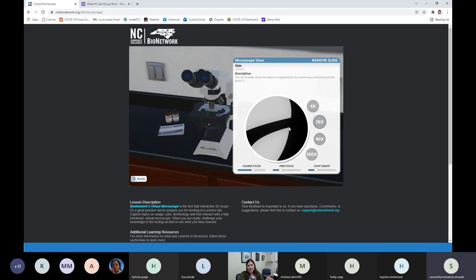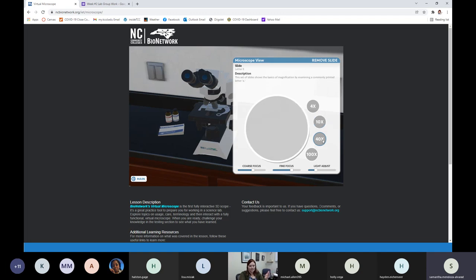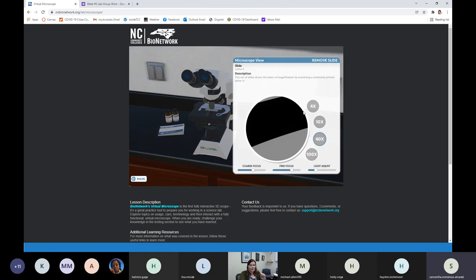I'm in pretty good focus on yellow. Going up to blue - when I'm here on blue I better not play with that coarse adjustment knob or I will break my slide. I can use the fine adjustment knob to get it as crisp as I want, and I can also play around with the light adjustment knob or the iris diaphragm lever to adjust the light. So we used all three objectives to look at the letter E slide.